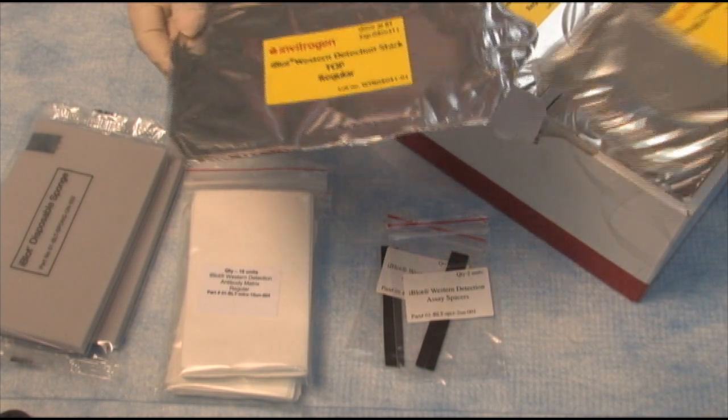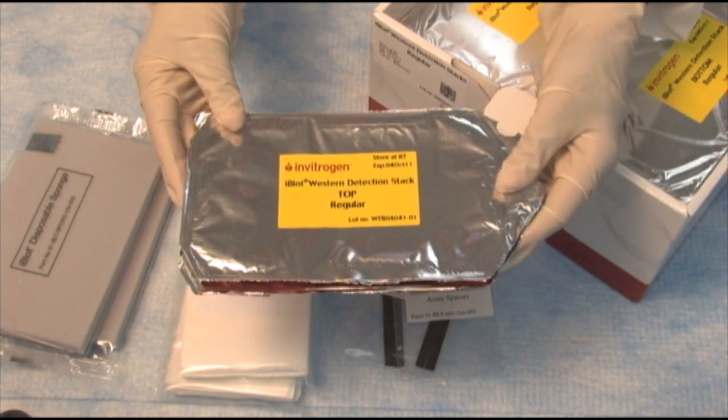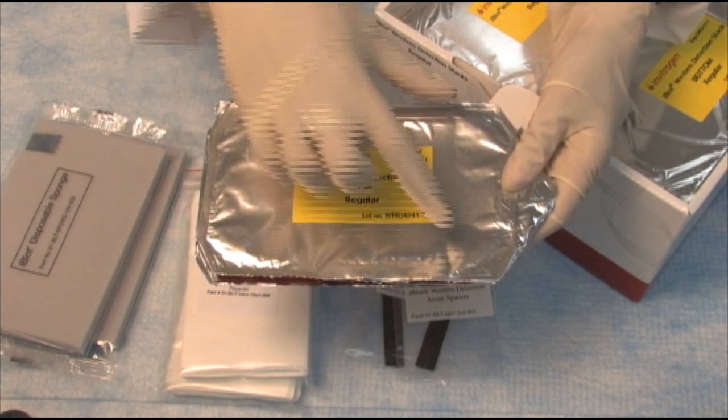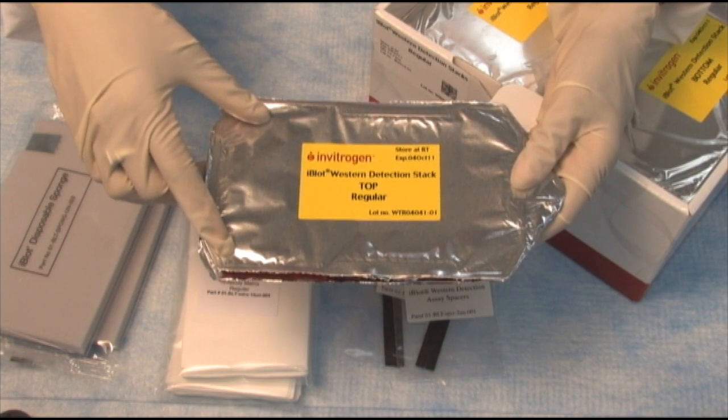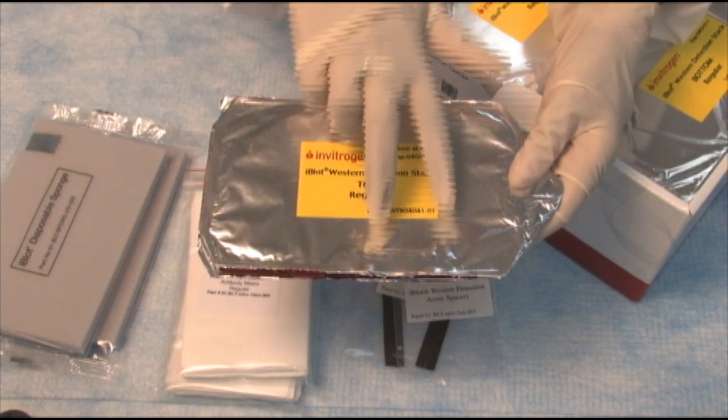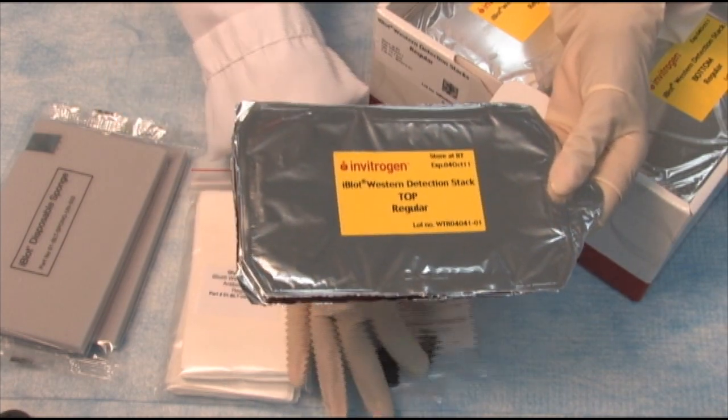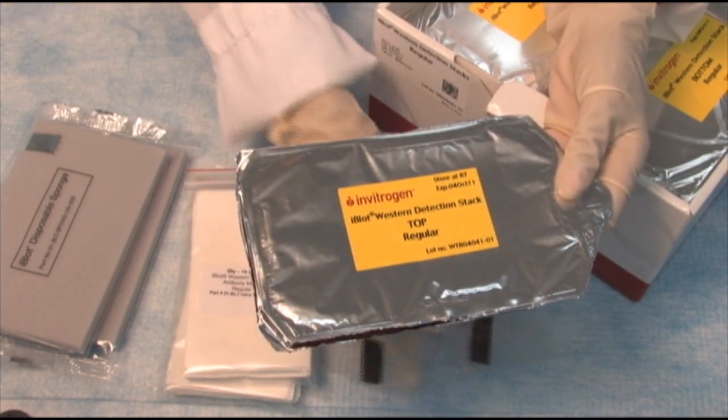And then we have the top and the bottom stacks. I have the regular size stacks here. So these allow you to do one midi-sized blot, or you can do two mini-sized blots. Or you can do multiple smaller blots and then use these spacers to separate them out.